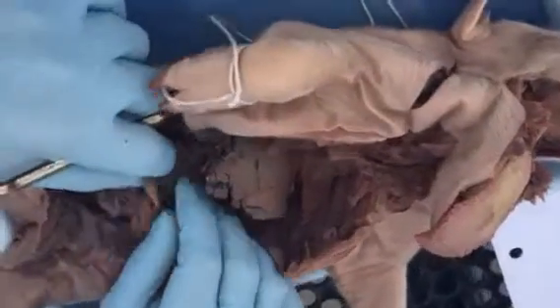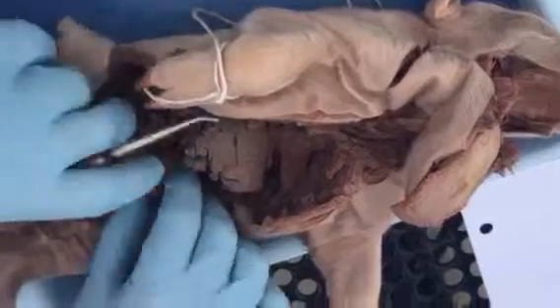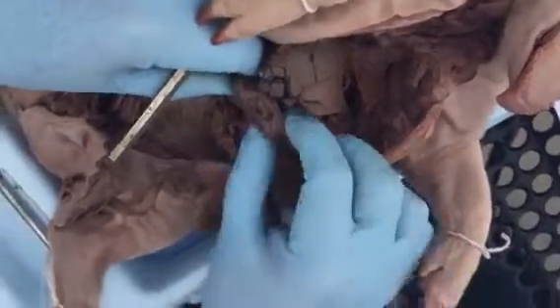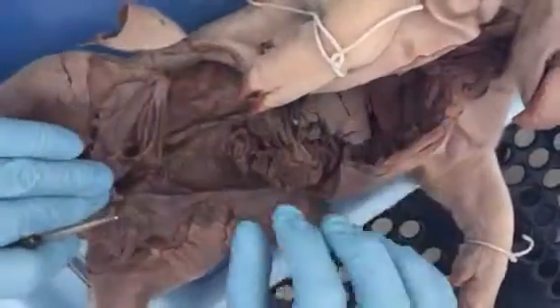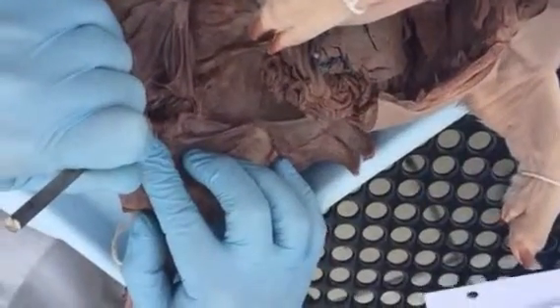Okay, large intestine. Again, went over the cecum already. That's the cecum right there. And then as it goes the other way, it will lead into the spiral colon, which is this. And it's aptly named because it looks like a spiraled up snake or rope. Okay, and then it goes to the descending colon, which all the way down here will lead into the rectum. So that's the rectum right there.